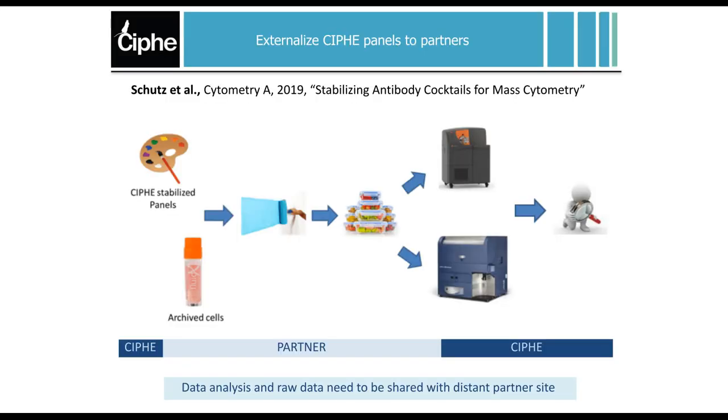And to do this, actually, we work fully with a panel that is done at CIPHE, or we actually work with externalization of our panels, which is possible in mass cytometry from this technology published in Cytometry A.